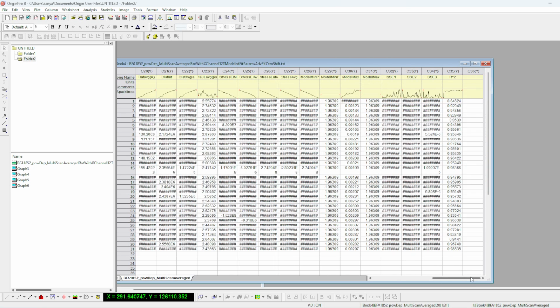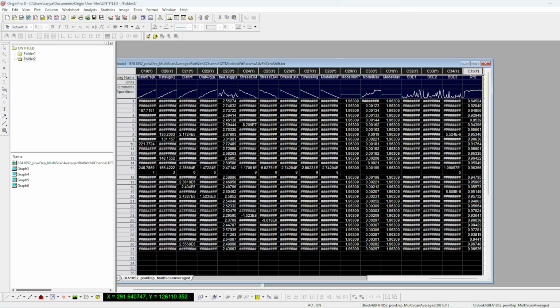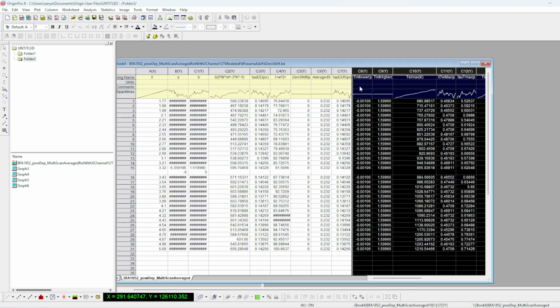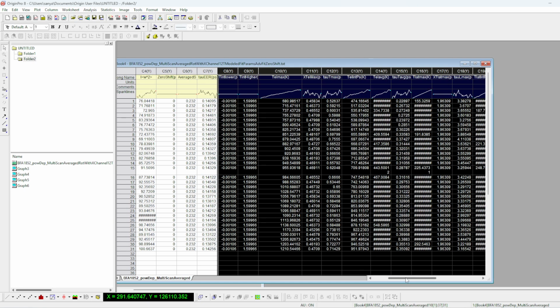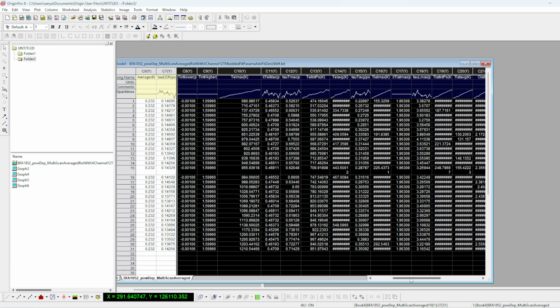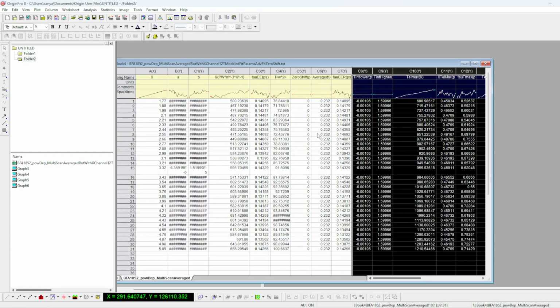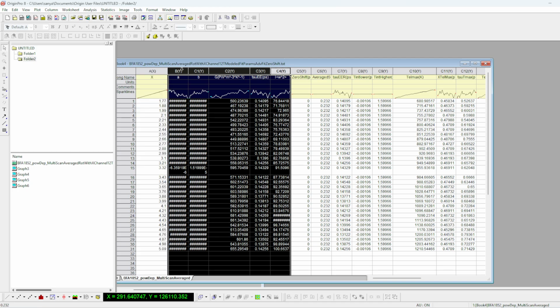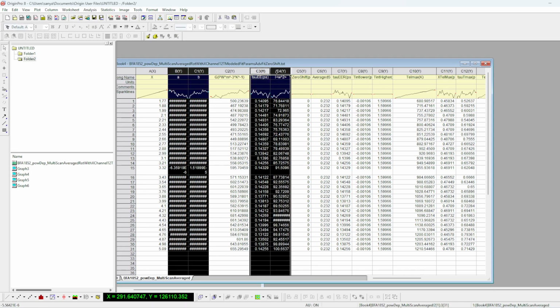But those parameters usually you are not interested too much in. Those are more diagnostic. Sometimes you want to look into the temperatures too, but usually the parameters that you are interested in are only the first 5, realistically only these 4.